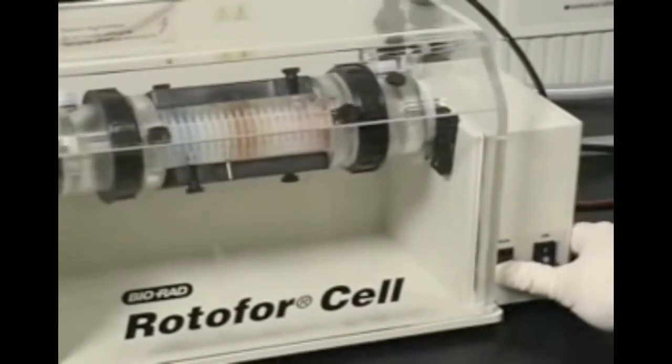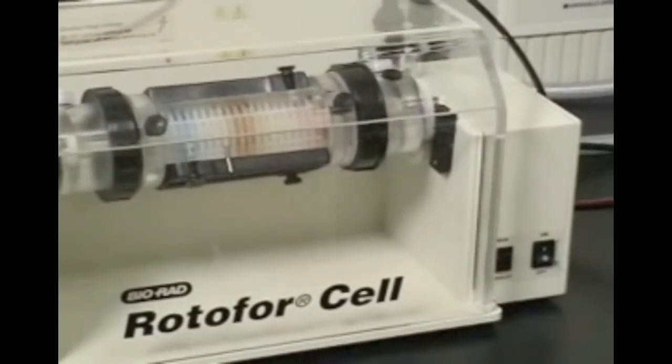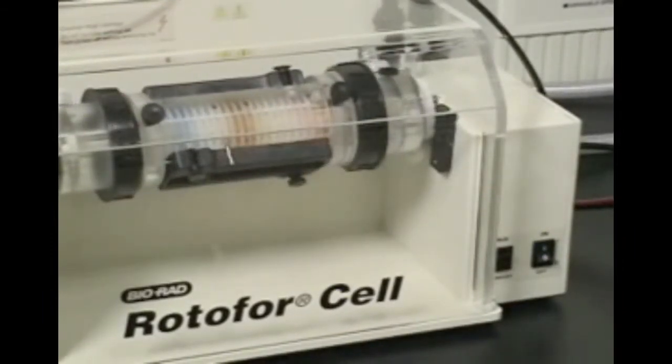Cytochrome C is an orange protein with a PI of 9.6. This protein focuses nearest the cathode.